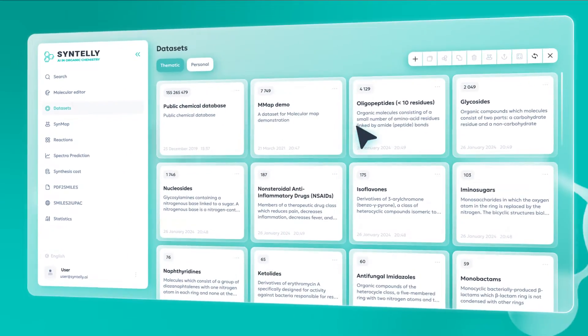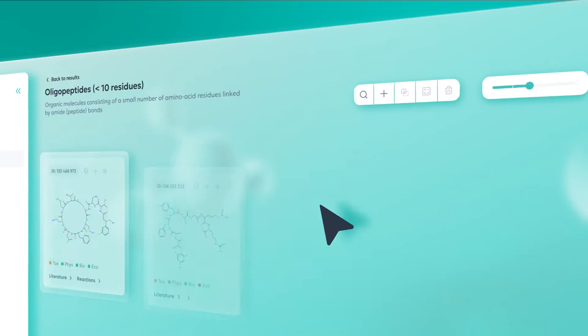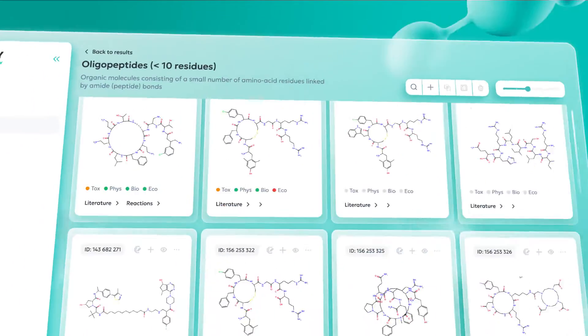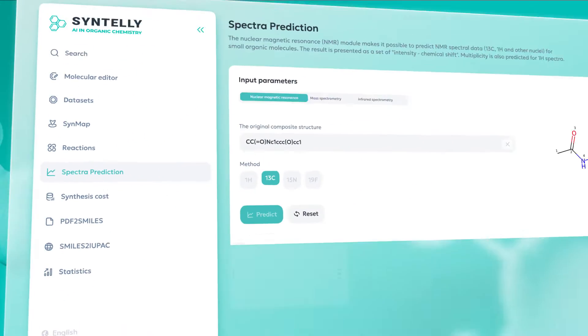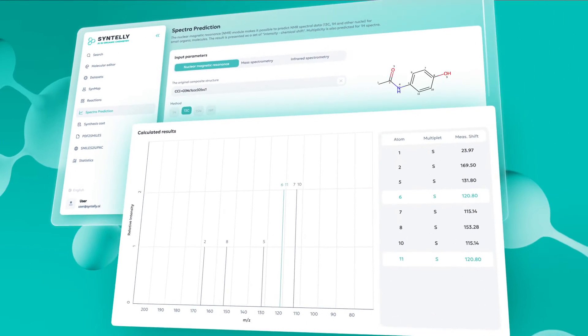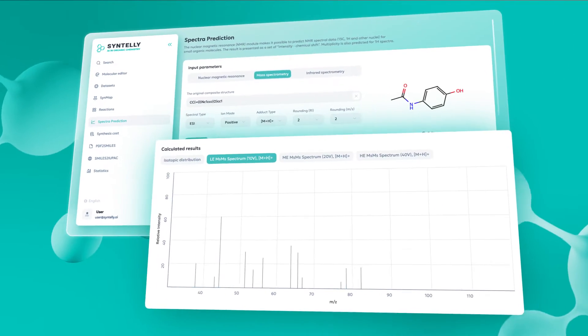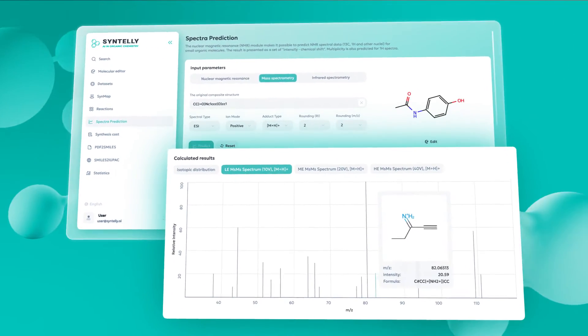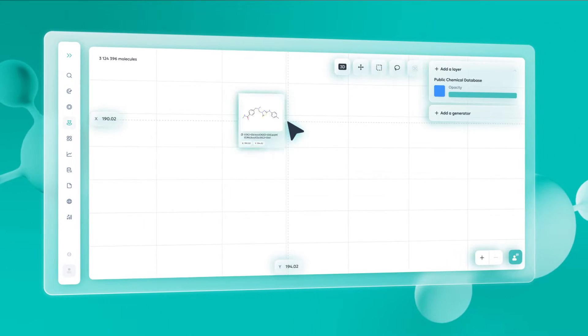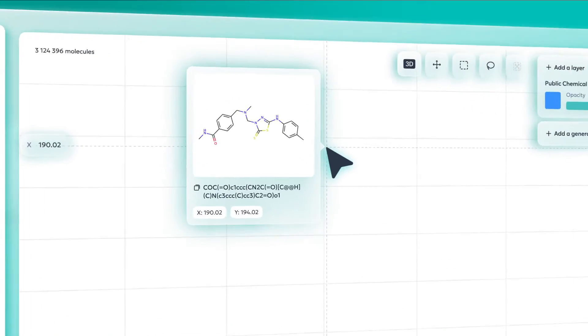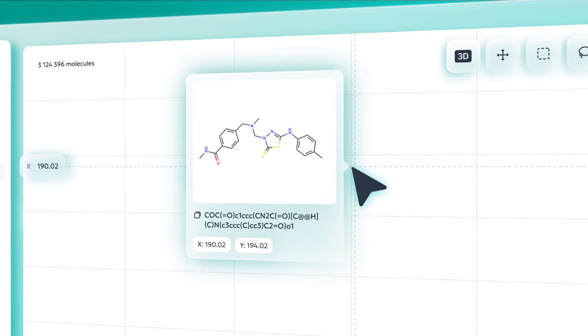Ready-made thematic sets on molecular targets and therapeutic indications are also available. Perform spectra prediction — nuclear magnetic resonance, mass spectrometry, and infrared spectrometry. Analyze large amounts of data using molecular mapping and generate new structures with specified properties.